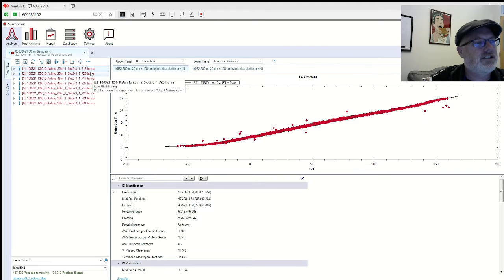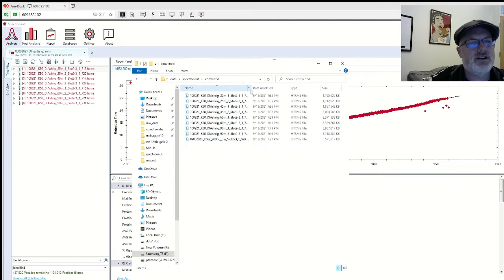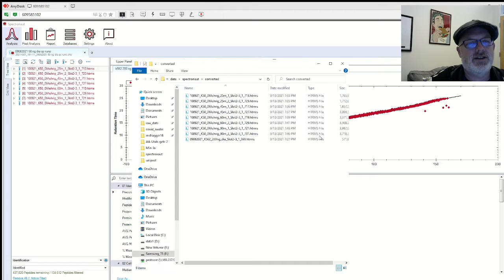You can see the different files that are loaded. There's currently 1, 2, 3, 4, 5, 6, 7, 8 mass spectrometry LCMS files loaded. They're red because they are missing their raw files. Usually this does not make any difference, but there are some visualizations where it's still needed. I still haven't quite figured out what those are. If you want to turn them not red, you could download all of these here, or I believe we've already converted these to Spectronaut HTRMS files, and we have the converter to do this, so don't worry about it.